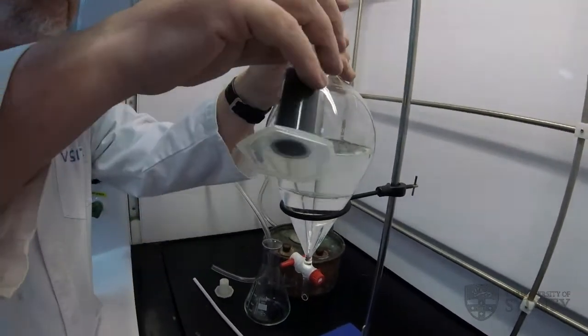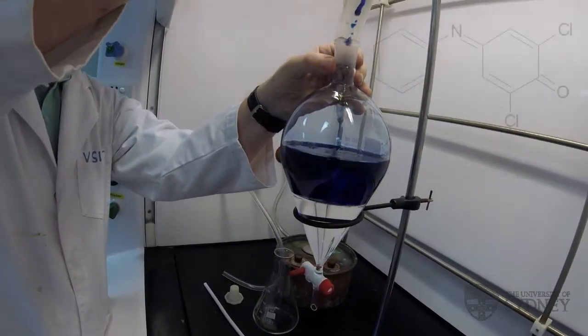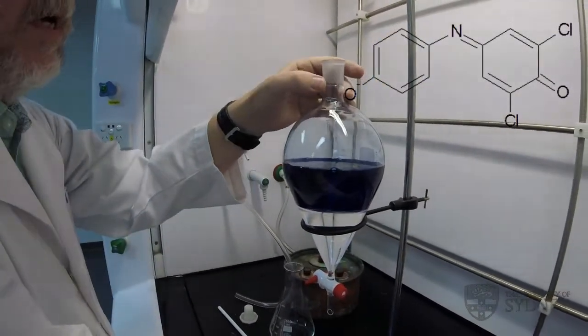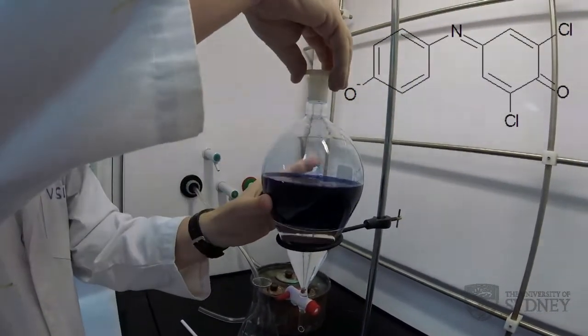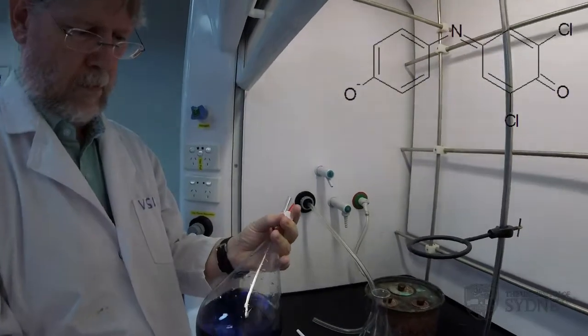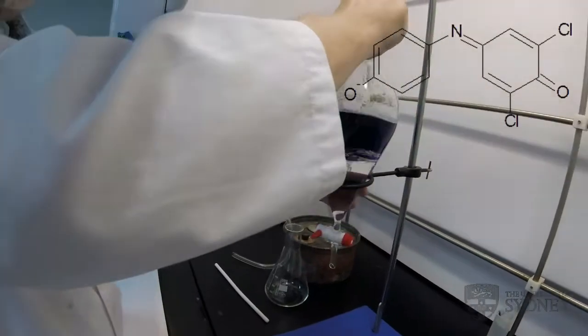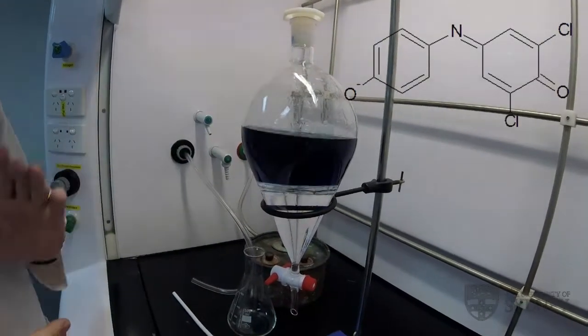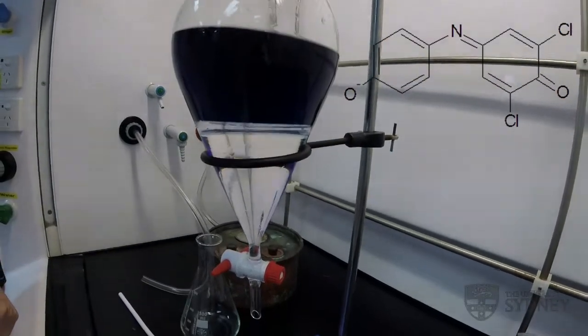So here's my indicator, which you can see is soluble in the water layer. I'll just give that a little mix. So as we'd expect, an ionic species is soluble in water and not soluble in our organic solvent.